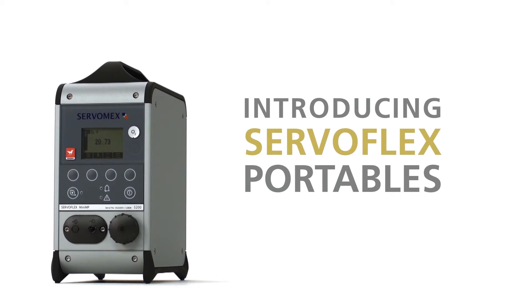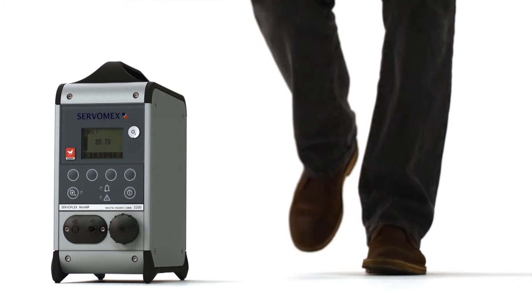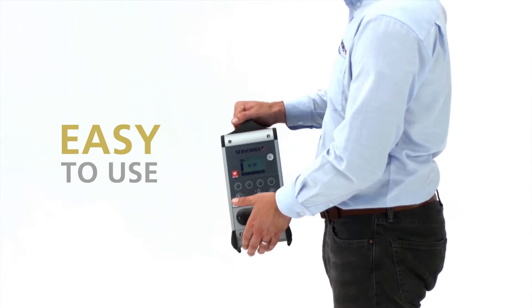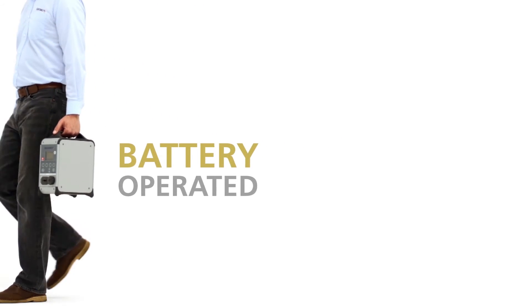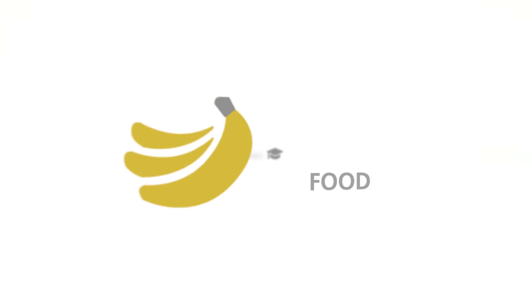Introducing the Servaflex portable gas analyzers — they're compact, precise, and reliable, and very easy to use with battery operation that enables total portability. Used in a wide range of applications, from labs and plants to food production and universities.